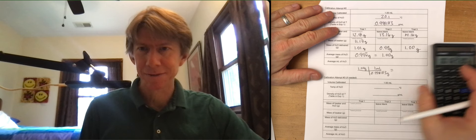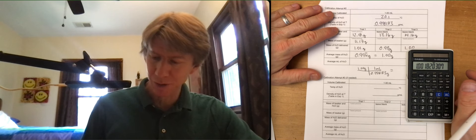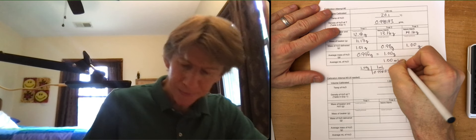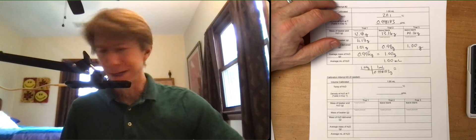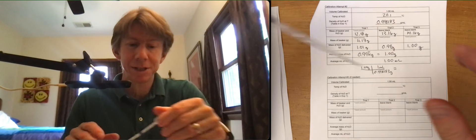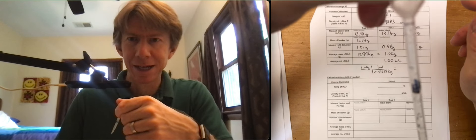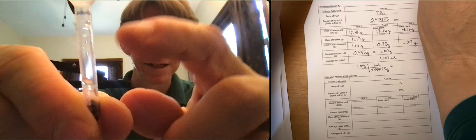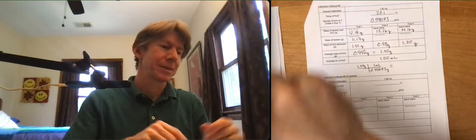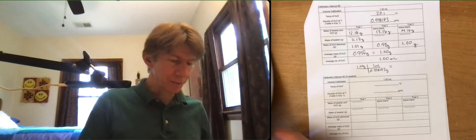And you don't have to write out your calculation, but I'm going to 0.998183, or you don't have to write it out the second time. Please write it out the first time. I get 1.00183, or 1.002, which works out very well. And I don't want to bias you in any way, but our pipettes should be the same. And so if you can see my line, I don't know how to show it to you nicely. Here's the one milliliter mark, and my line is, you can see where it is. It's below the actual attachment point to the bulb and above it. So, well, all right, so we go back to the flowchart.